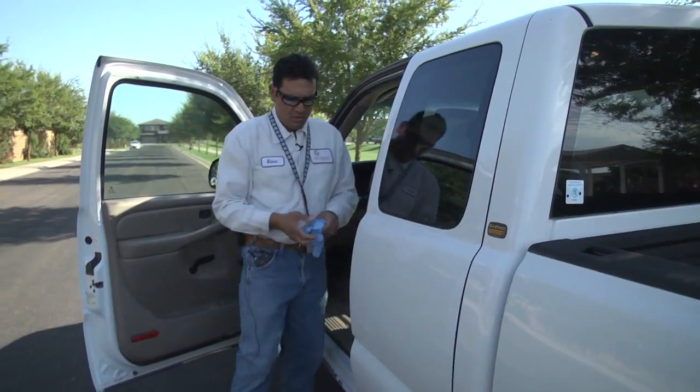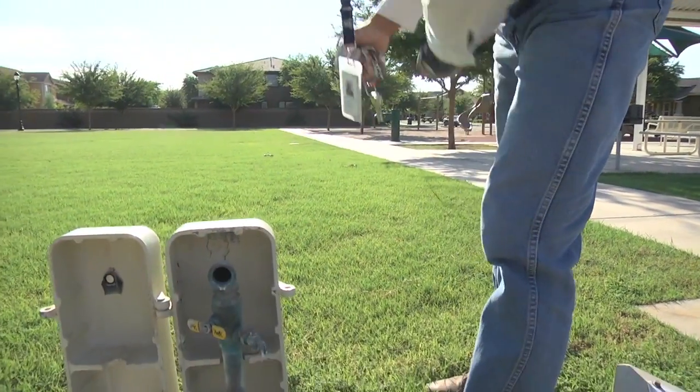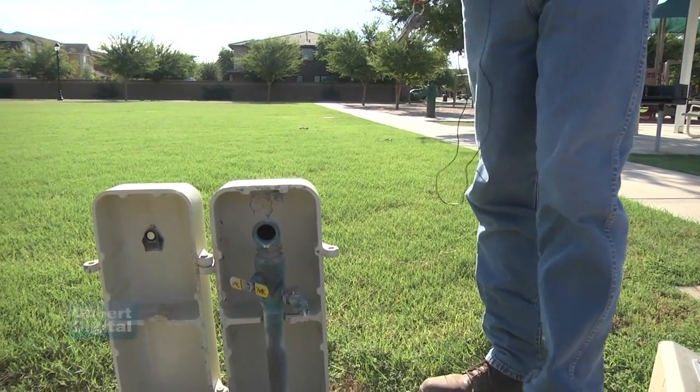I'm a water quality tech, and we are in charge of taking care of the distribution system. This is one of the 150 sample stations that we have.